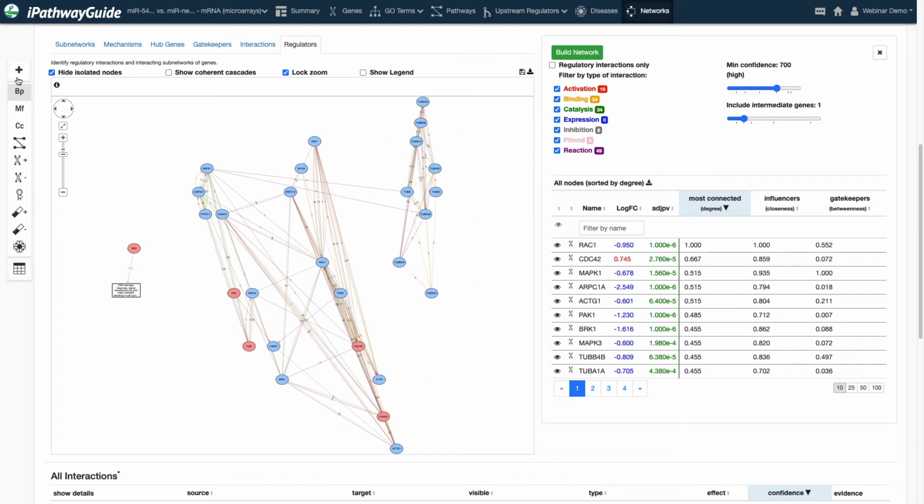Okay. You can do this kind of network analysis with all kinds of different things. I want to show you other ways to interpret the network. So let's stay with this network and look at a couple of different views.